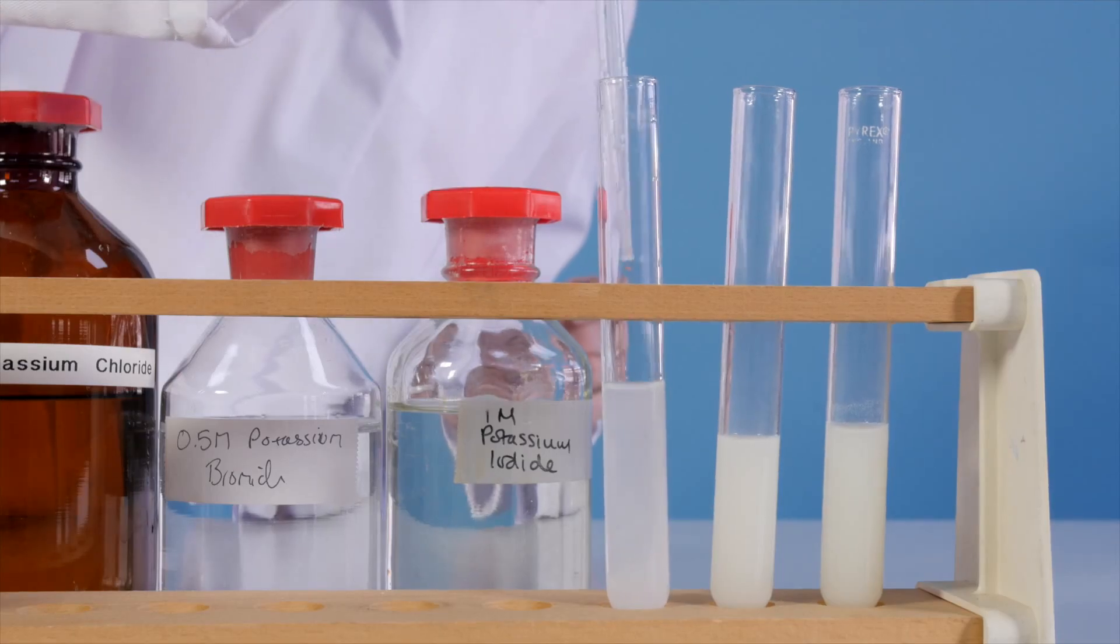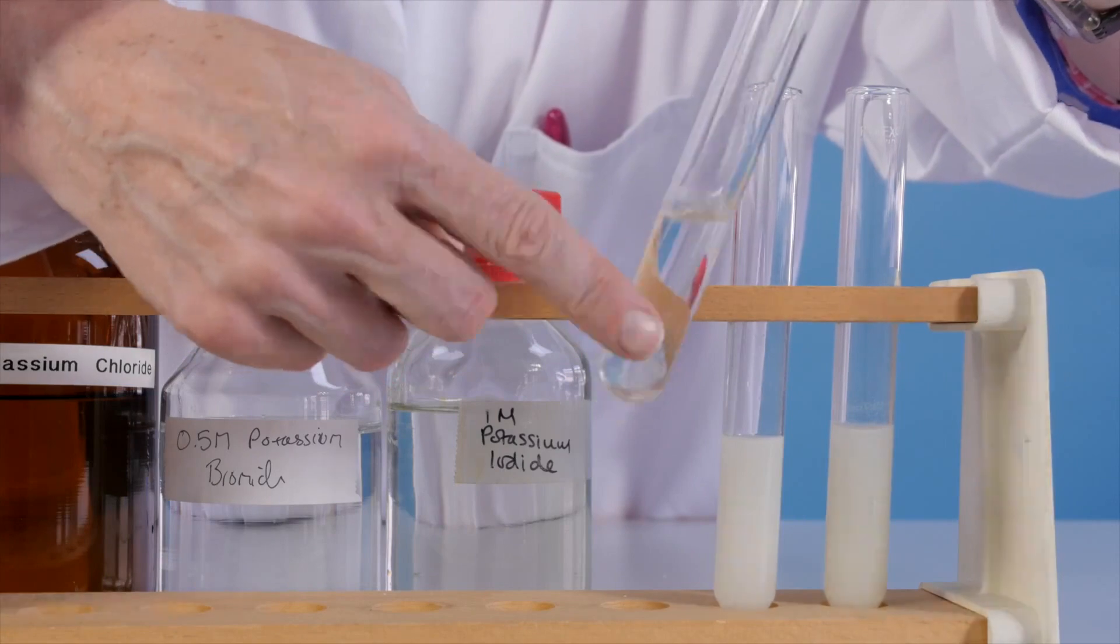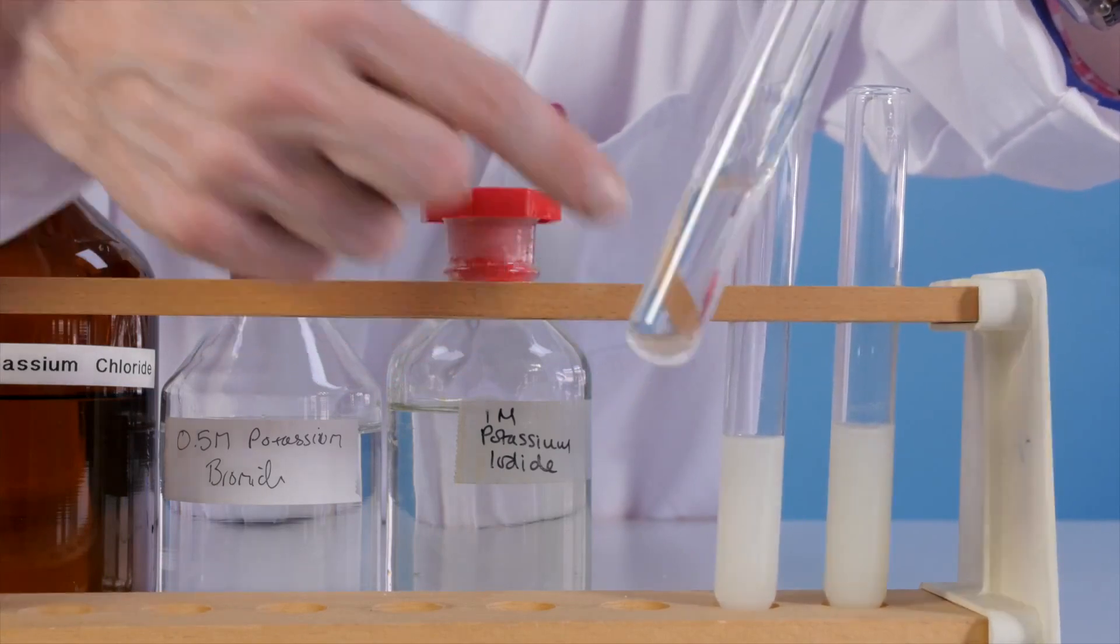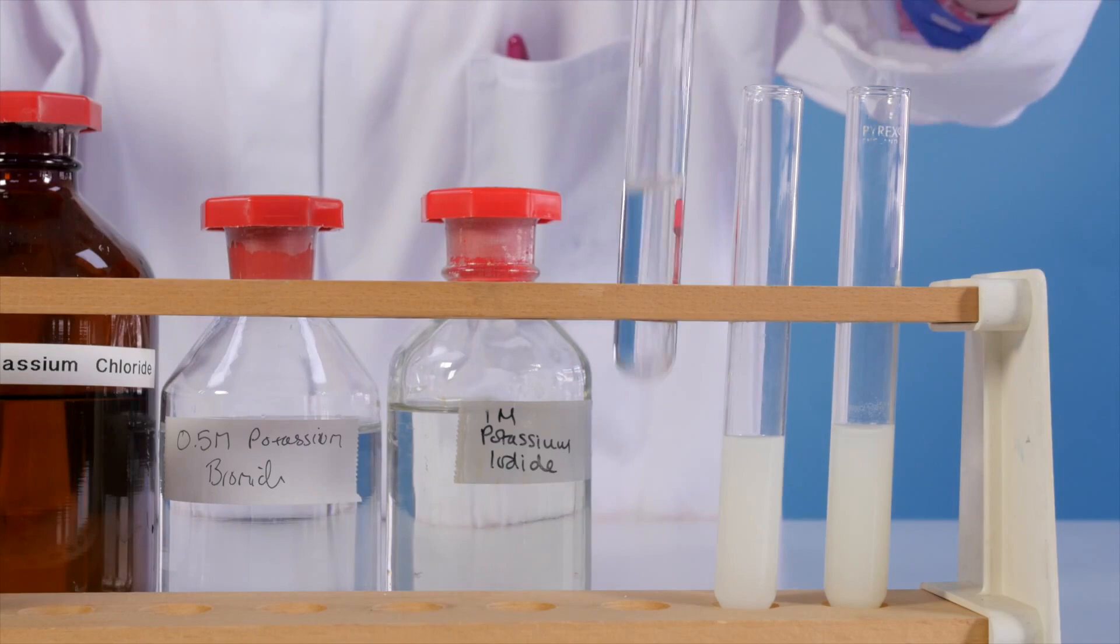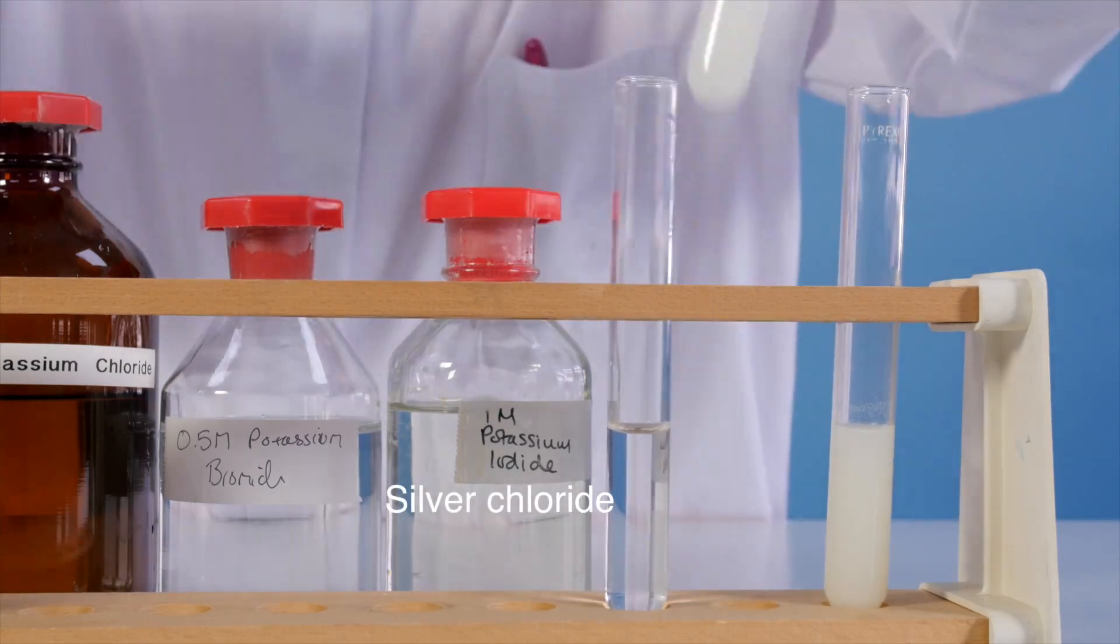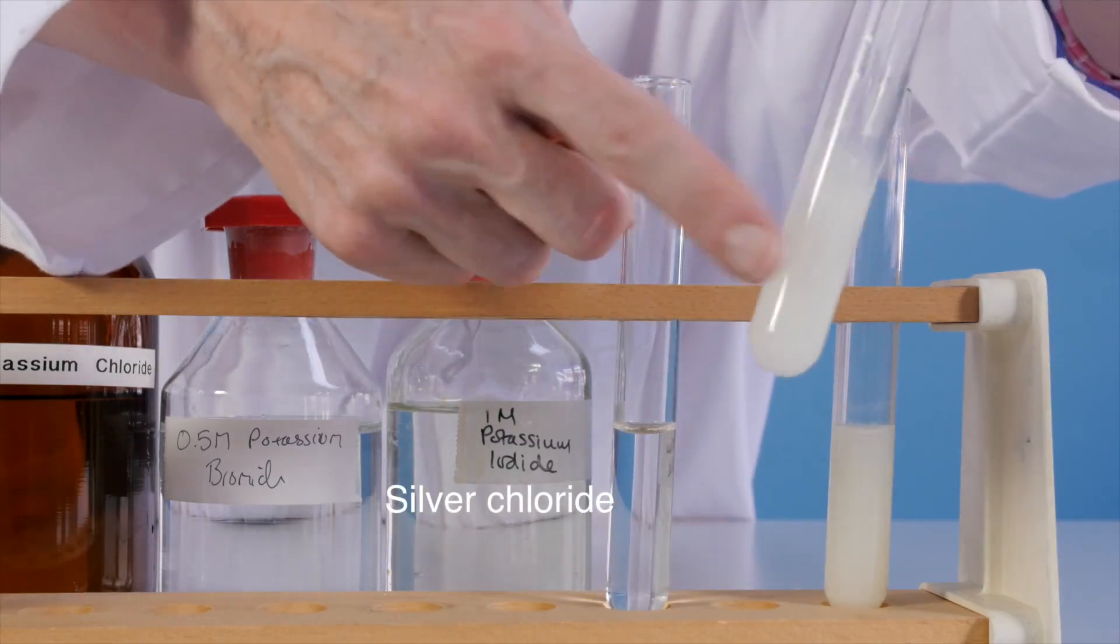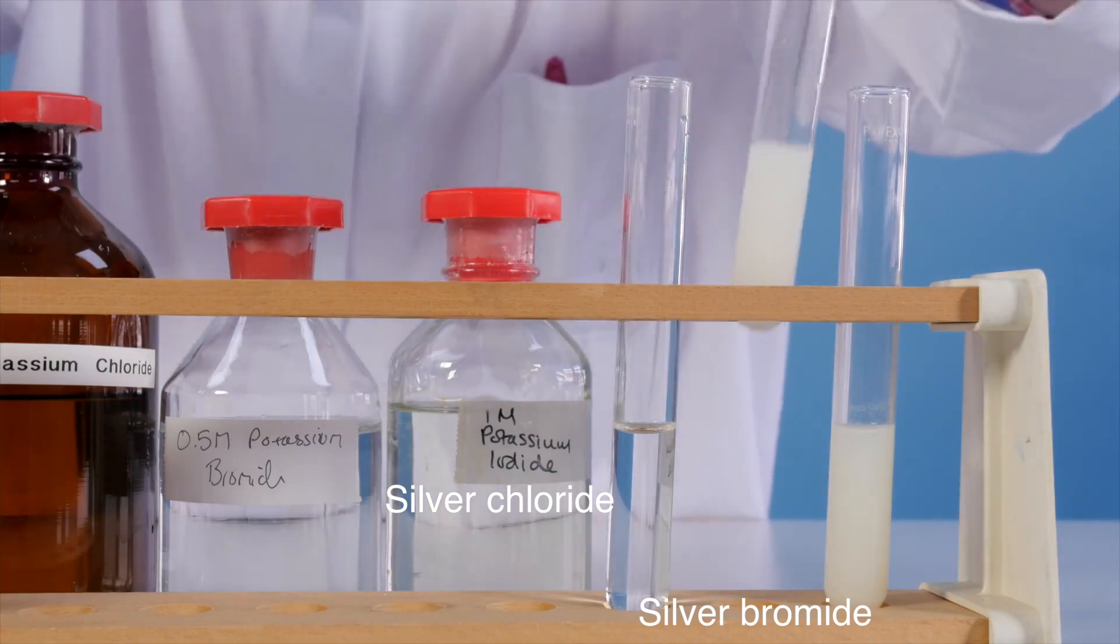It can be difficult to distinguish these colored precipitates, so next we'll add some dilute ammonia to each of the samples. The white chloride precipitate disappears, so we have confirmed chloride ions in that solution.